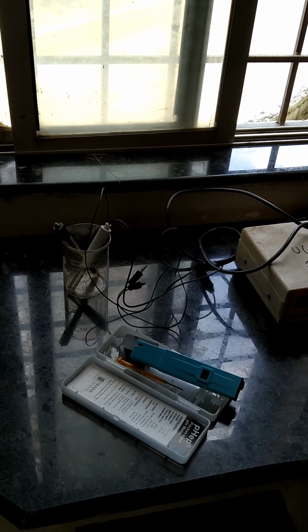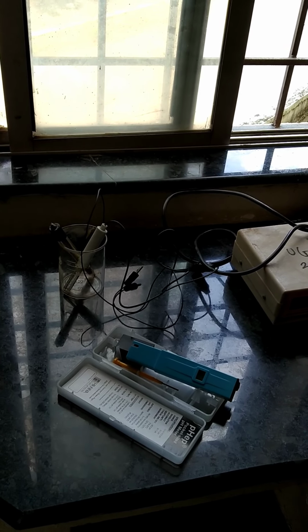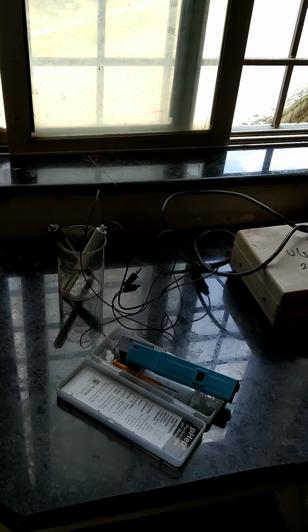learn which instruments and which glasswares, and what type of chemicals are used in the analysis in laboratories. Just for the sake of idea, today I am going to throw light on the glassware, equipments and laboratory items which are used for inorganic experiments in the practical chemistry.